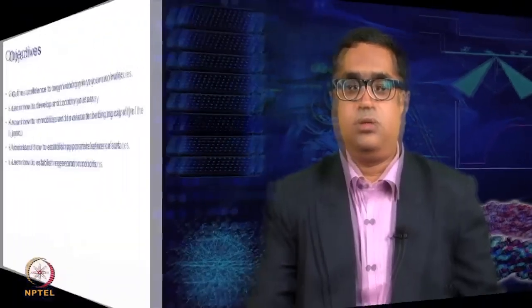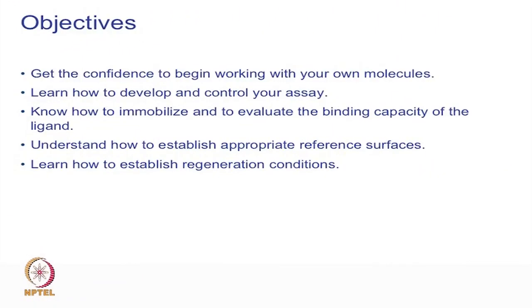In this session, we will understand how we can develop an assay, a Biacore or a surface plasmon assay, and the objectives of this particular study are to understand how to work with the molecule, how we will develop an assay, control an assay, we will understand about the reference surfaces, we will also understand about the regeneration of the surfaces and all that. And coming to the different varieties of assays that we have, one of the very simple ways of assay would be a direct binding assay.